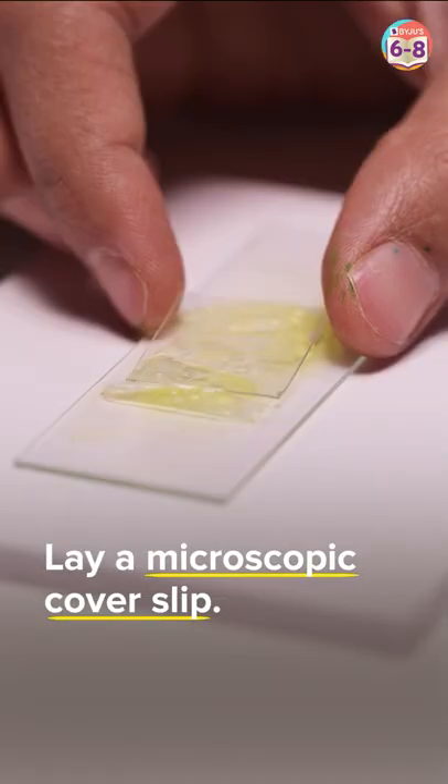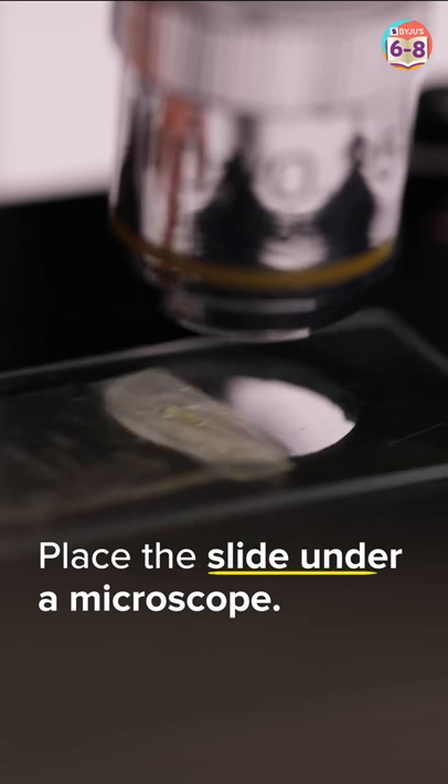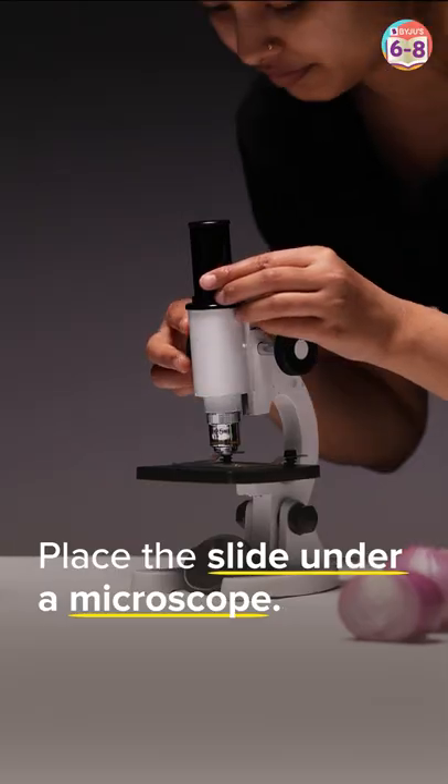Next, let's place a microscopic cover slip on the membrane. Absorb the excess liquid using a tissue or blotting paper. Place the slide under a microscope and adjust the focus.